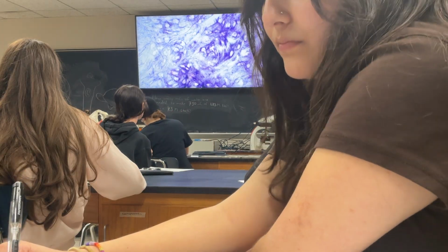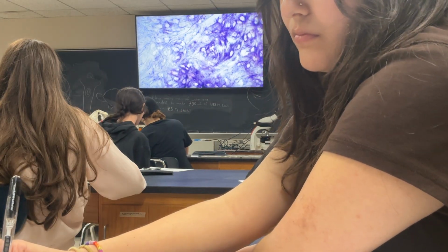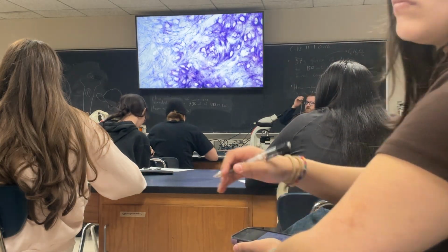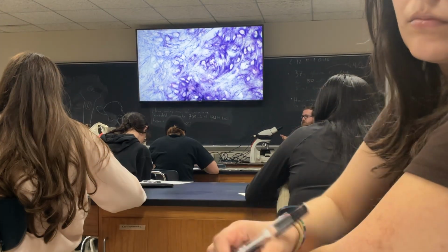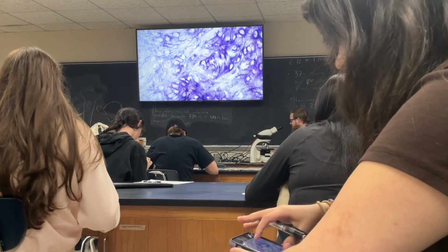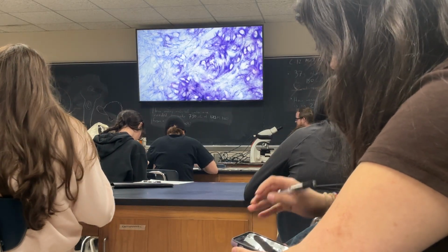Okay, fibro cartilage also has protein fibers. It's not completely different from this though. So I think elastic cartilage looks like grains of sand embedded in shattered glass. So we'll see hyaline. Questions on elastic cartilage though?